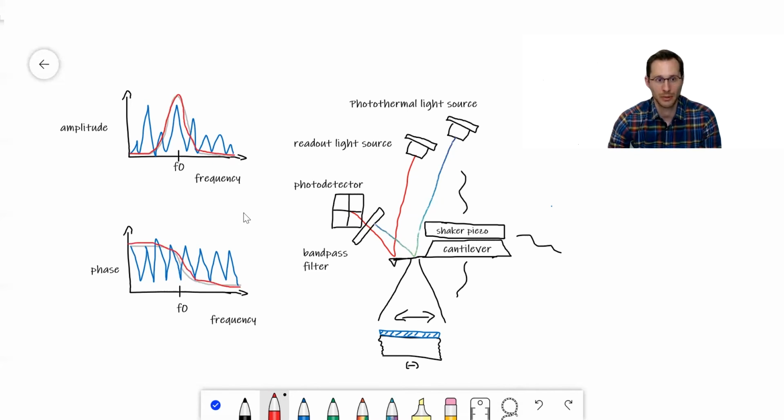And so the nice thing about this is, for the user, it becomes very, very clear which peak to operate at, or which frequency to operate at. You work at what you predict for your cantilever resonance frequency. And also, if you start to think about using the cantilever response in some kind of a model, you have a response that's much more closely matched to theory. So you can better apply theoretical models to your cantilever response in terms of your experimental setup.